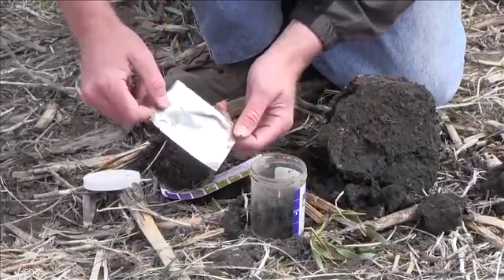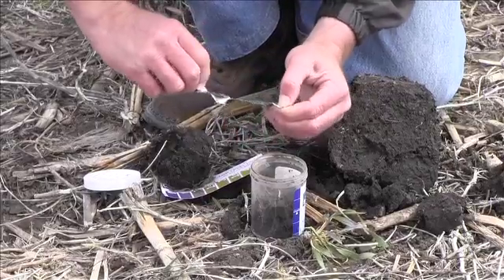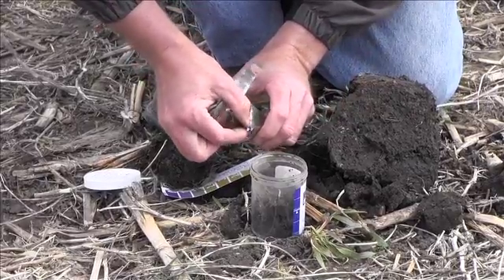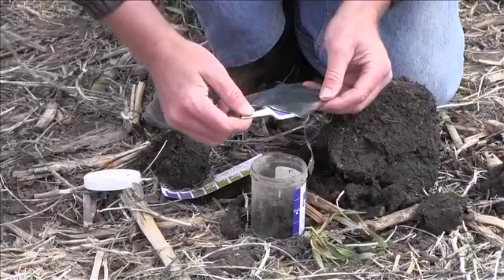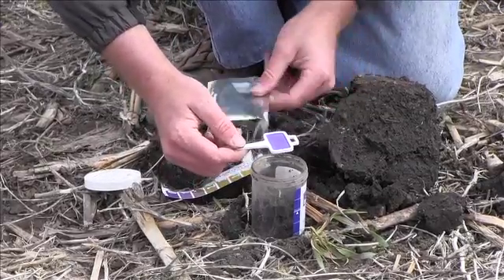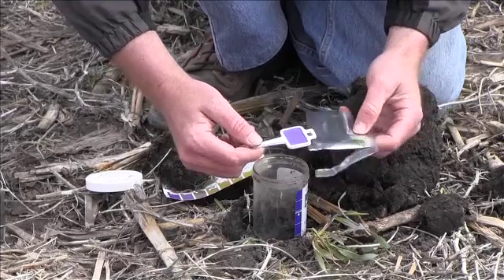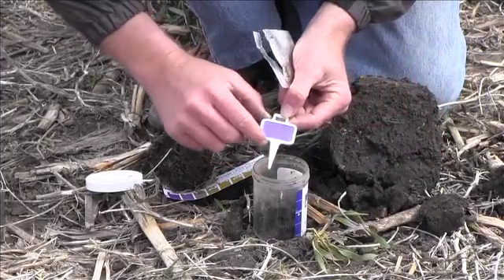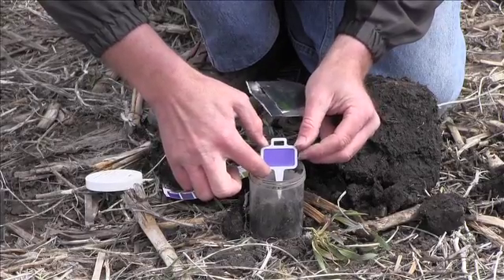Here you have the respiration gel packet. Gently open that packet, preferably with the anchor sharp point pointing down, so you can pull that right out of the bag. You'll notice that the gel is colored purple. Try not to touch that gel because it will get your fingerprints and bacteria from your finger on it and it will affect your test. Gently place that into the jar with the placard facing outwards to the clear portion of the jar.